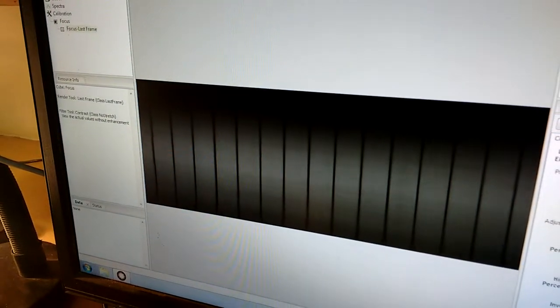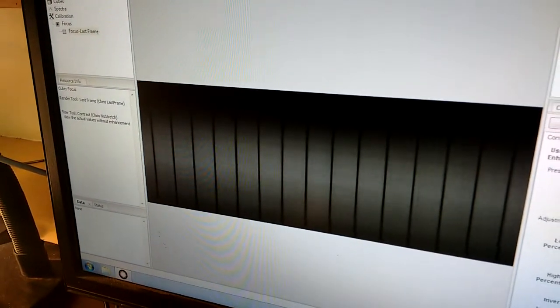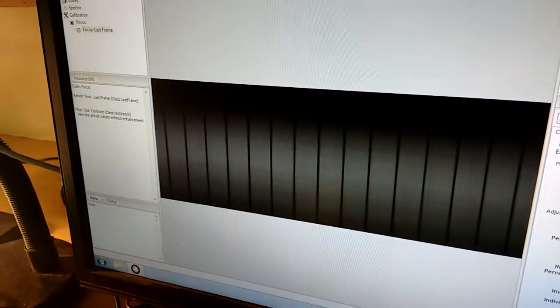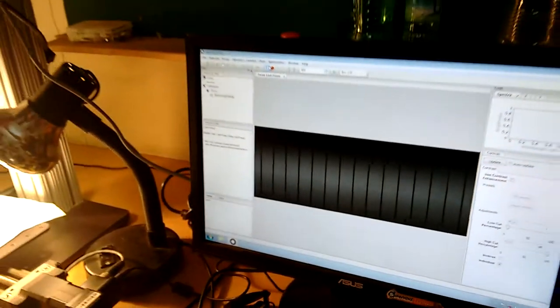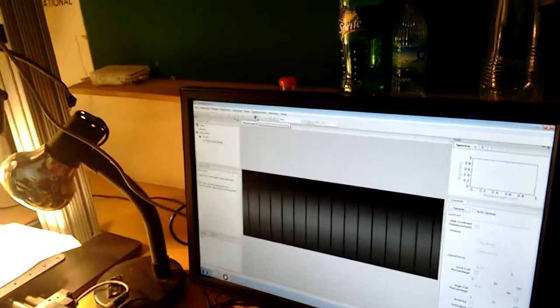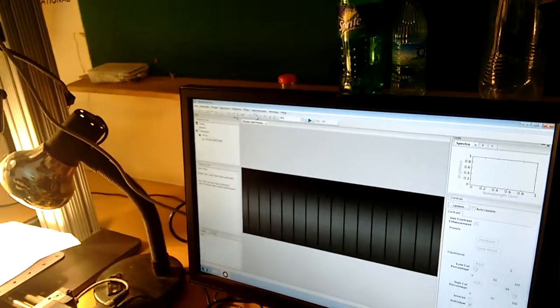So I feel this is the best focus point. I leave the camera there and I say I leave the focusing window.